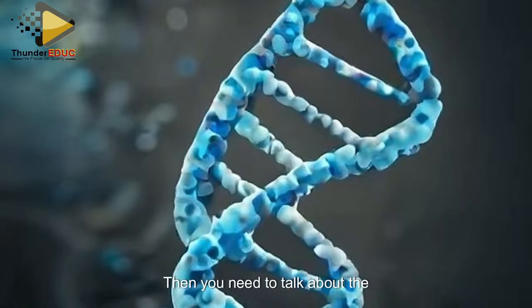Then you need to talk about the experimental errors. Definitely, maybe you can talk about temperature. Then you can talk about the conclusion: maybe a simple process using the apparatus, whatever you have used, can be used to extract DNA threads from a banana or from banana cells, because you have used banana. Whatever you have used is still fine. So the practical of extraction of DNA is not that complex.